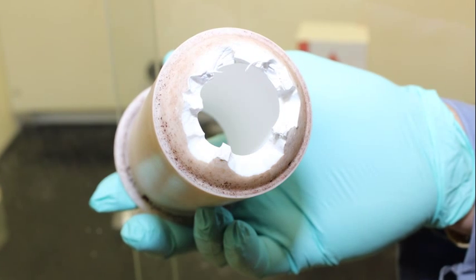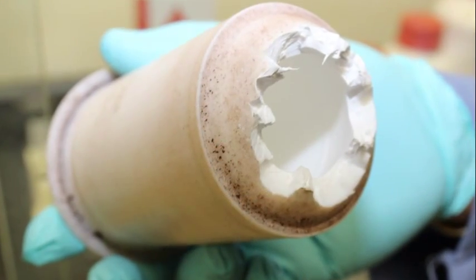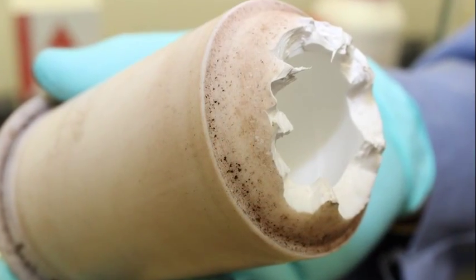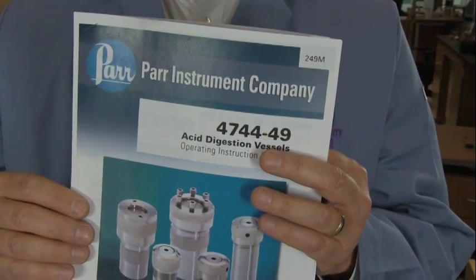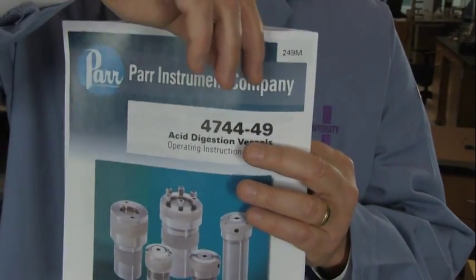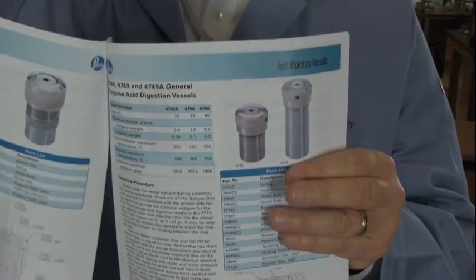This rupture of a laboratory reactor pressure vessel cup was caused by improper assembly. Before starting any experiment using pressure vessels, carefully read all vessel manufacturers documentation.